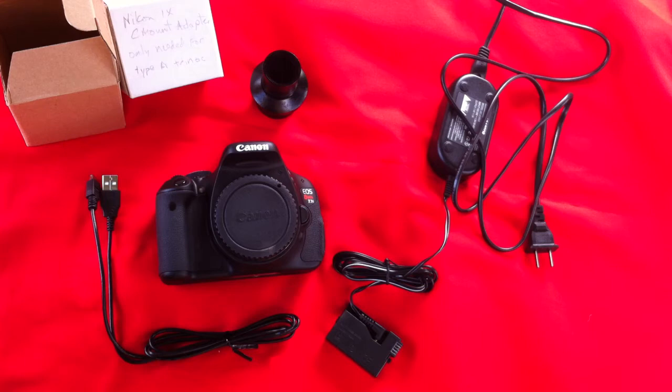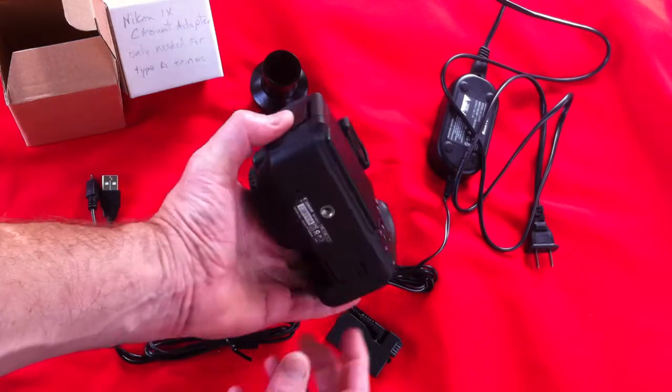This is a short introduction on setting up the Canon camera for use in a microscope. First, we'll put in the AC power supply in the bottom of the camera body.